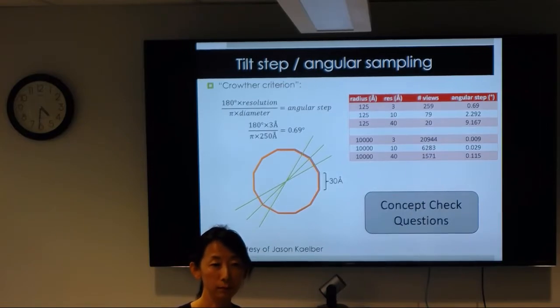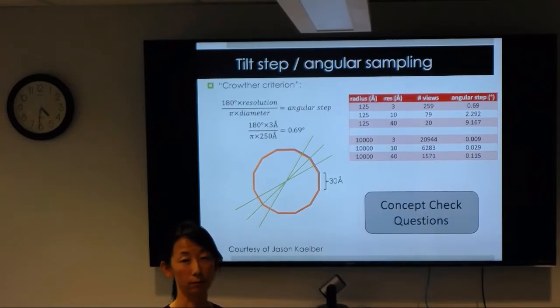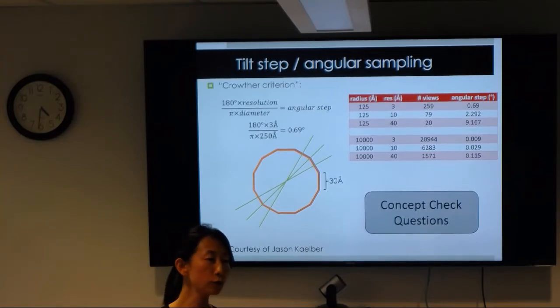Okay. But you'd have to collect more tomograms of different particles to be able to fill it in, to add to the multi-tomogram. Yeah. If you want to do subtomogram averaging eventually, you can collect more particles and compensate for missing wedge that way.